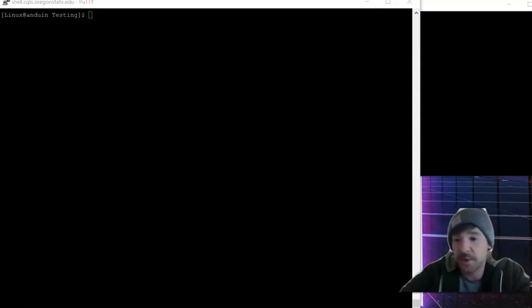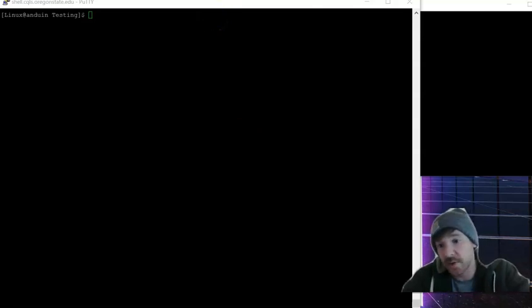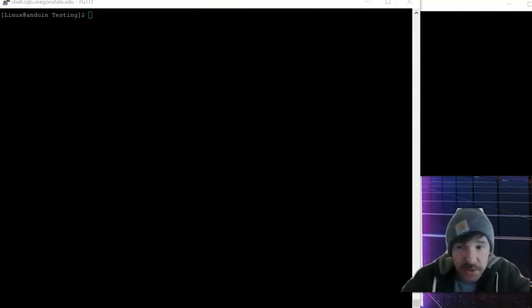In this last video that I'm going to make, we're going through how to run the bioinformatics tool HMMER. The previous videos showed how to download and install those programs, and now we're going to do a quick run-through of using HMMER to look for a specific sequence in a large genomic data set.